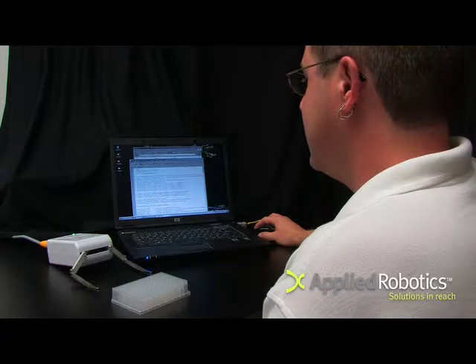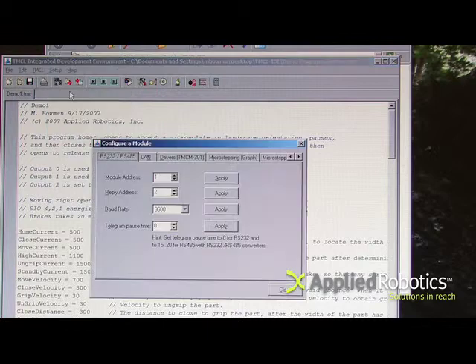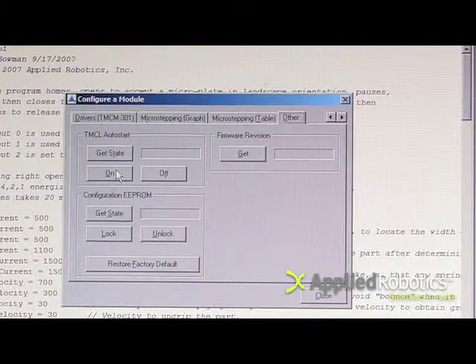If you want whatever program is stored in the smart gripper to run automatically whenever the smart gripper is powered up, configure the module for auto start using the setup auto start configure module. Select the other tab and TMCL auto start. Select on.